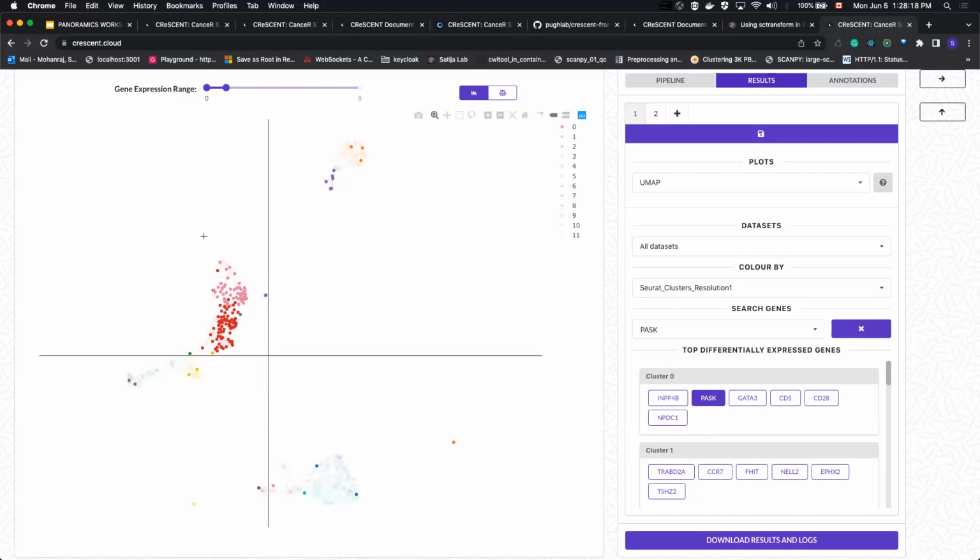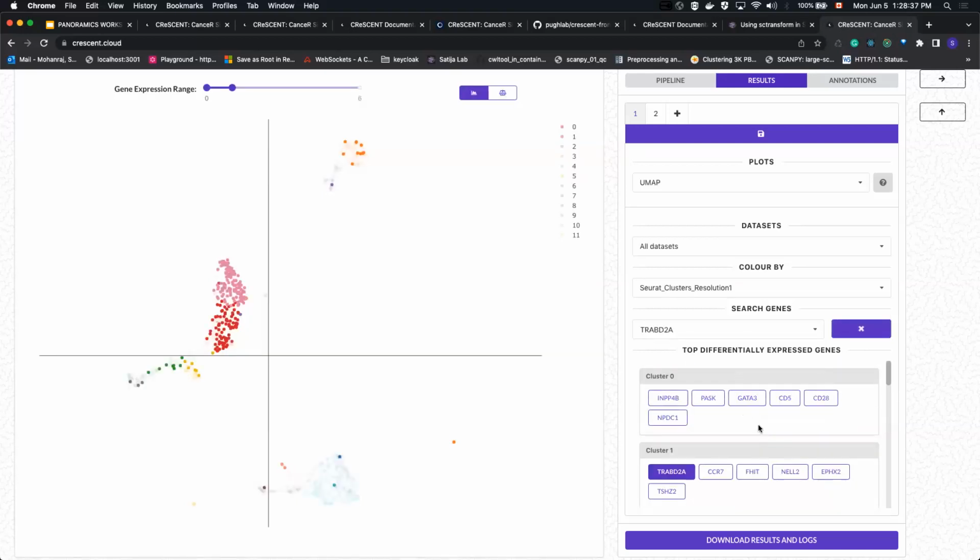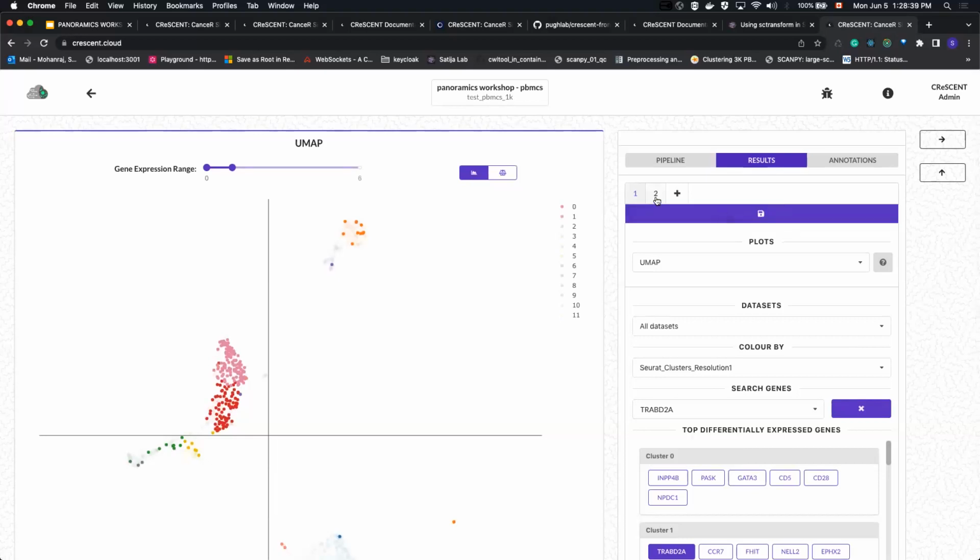So how can we maybe explore BRCA mutations, or can we explore TP53 and see which clusters actually express these things? The gene expression buttons are an easy way for you to handle that. There's also another way that we can do gene expression.